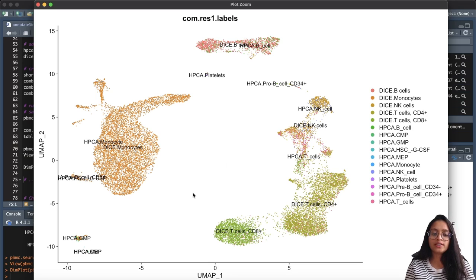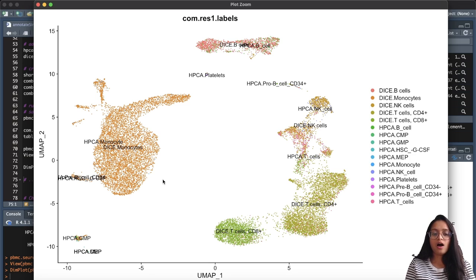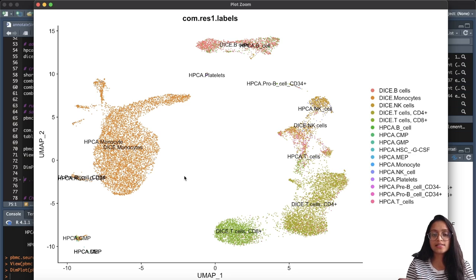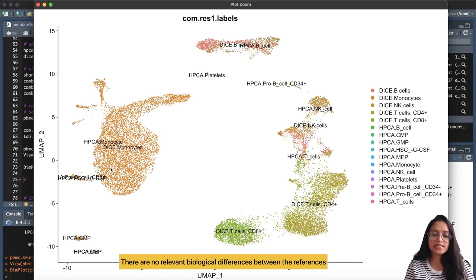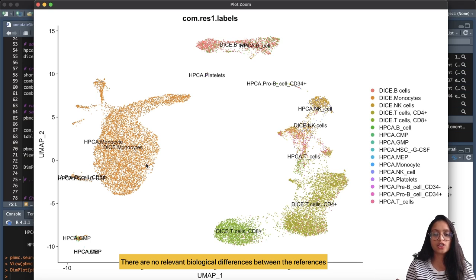Viewing the metadata from the Seurat object, you'll see the labels have been added. Now using this column as labels in our UMAP — zooming in on the plot — our cells have been annotated and the clusters show the labels of these annotations. Some cells that are essentially the same type have their highest-scoring label matching one reference versus the other. This combined reference approach makes more sense if trying to annotate a dataset with cells matching both references, but since we are annotating blood cell subpopulations and both references contain the same types of cells, this approach is not very useful here. What we'd really want is some harmonization across references, or one highest-scoring label across references.